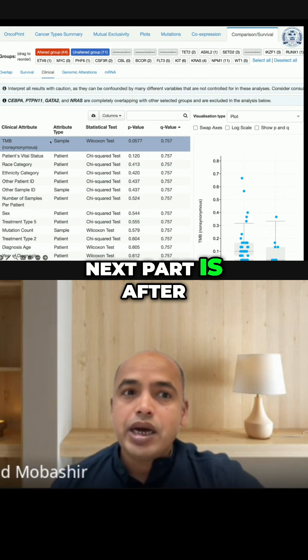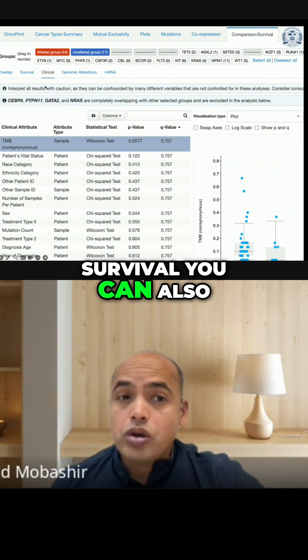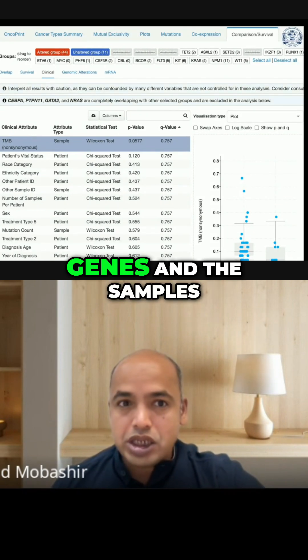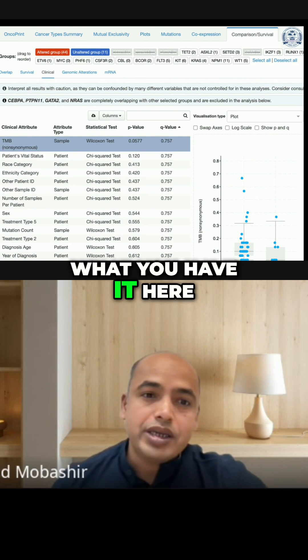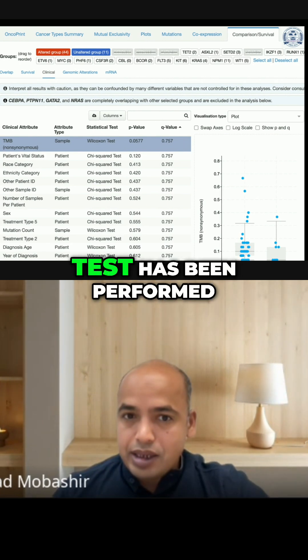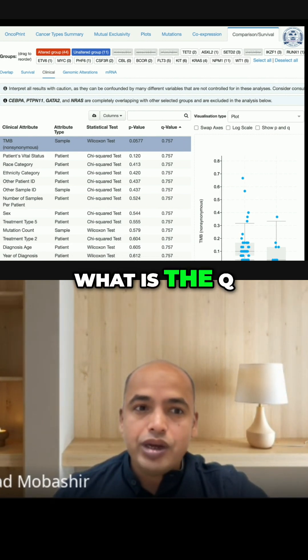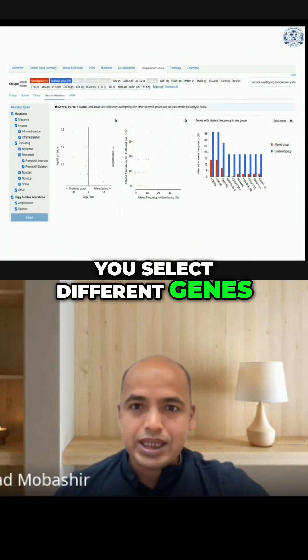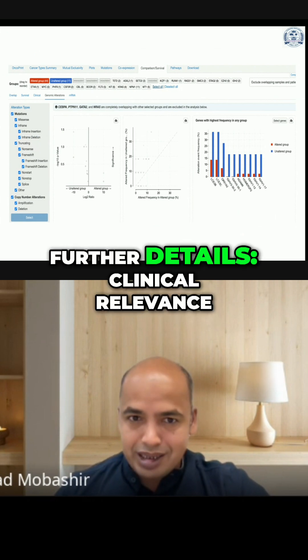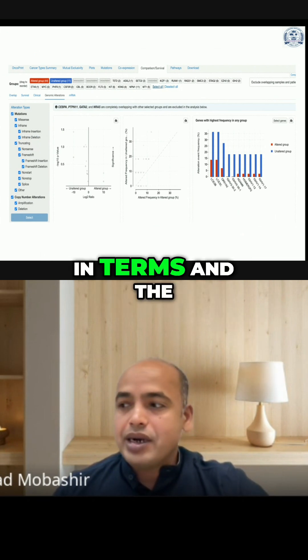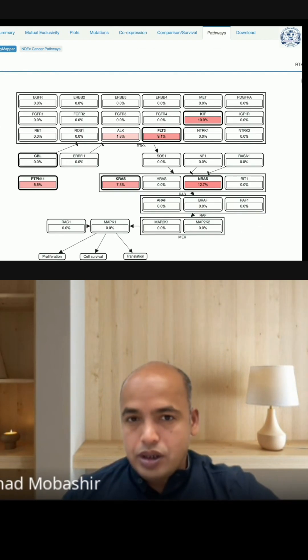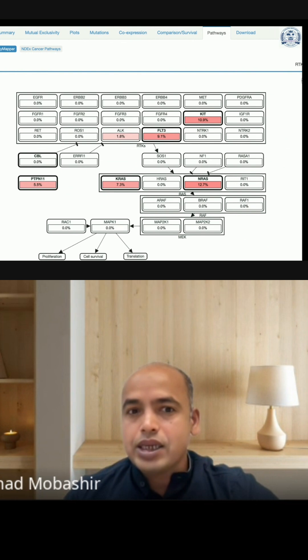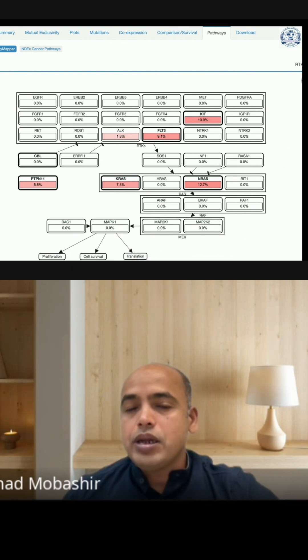After survival analysis, you can go further into the clinical relevance of these genes and samples. You can see what kind of test has been performed, the p-value, and the q-value. You can also select different genes and explore their clinical relevance in terms of genomic alterations — what is mutated and what is their phenotypic relevance.